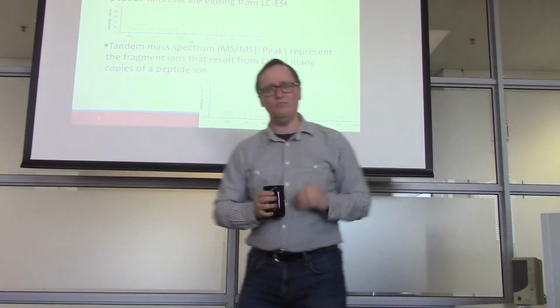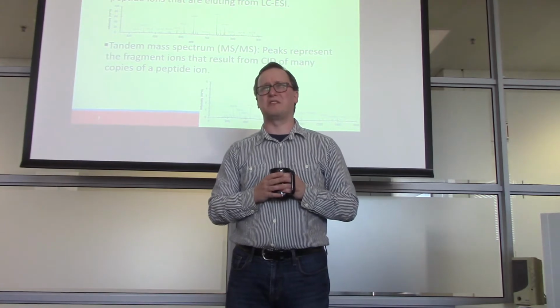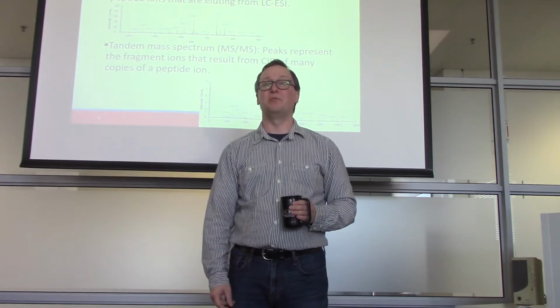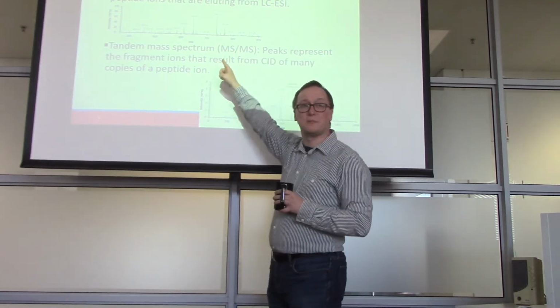Okay. How is a mass spectrum different from a tandem mass spectrum? I have to say, this has been one of my favorite quiz questions over time. I decided it was so important I would just make a slide about it. So first off, we have a mass spectrum.